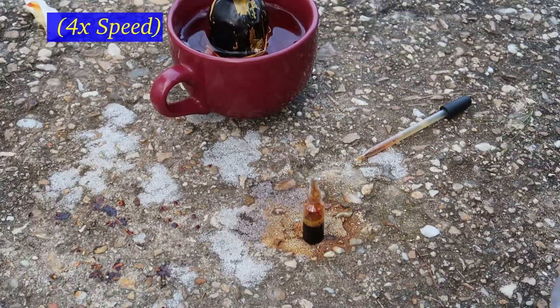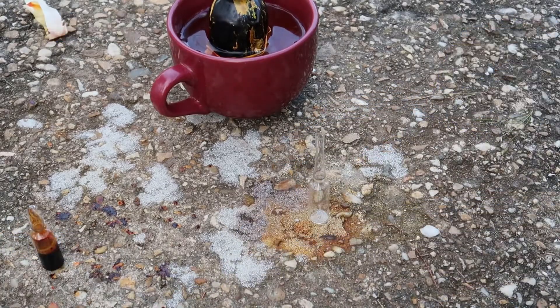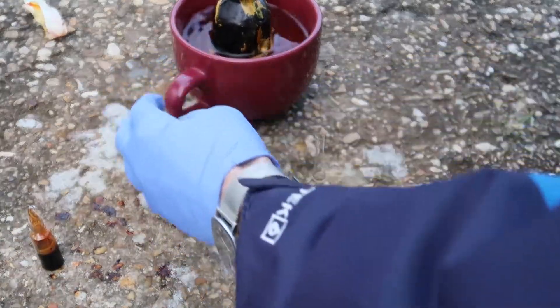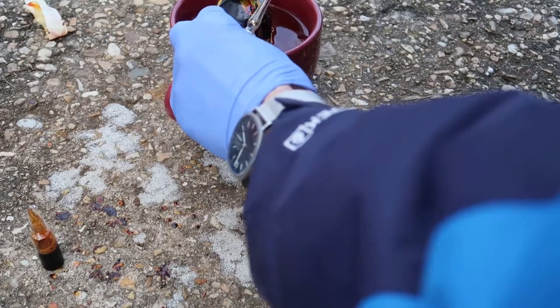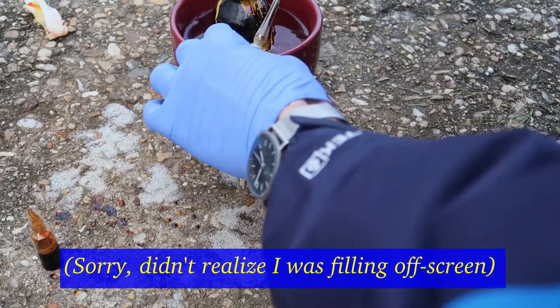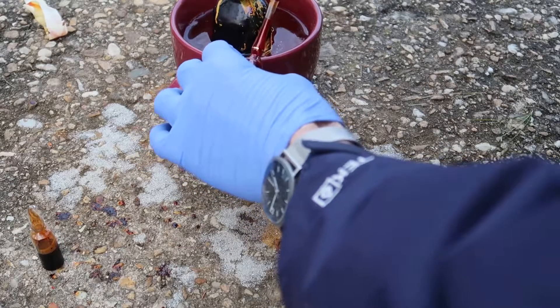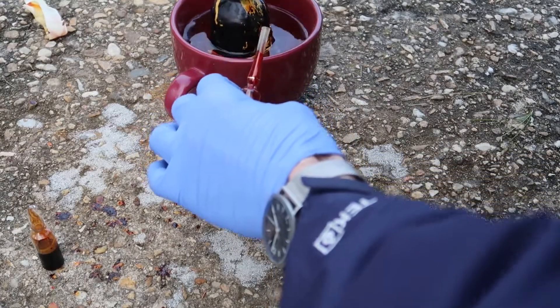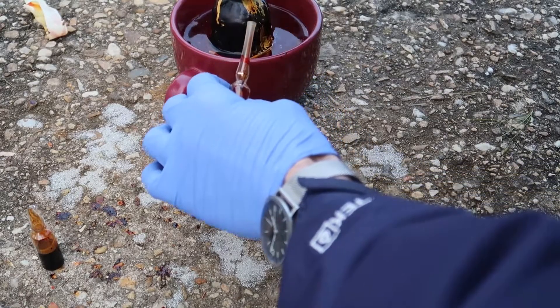Let's get another one. That's the scary stuff, man. The wax on the top of this bottle was completely obliterated by the bromine - utterly, completely. There was a wax seal on the top and it's gone.